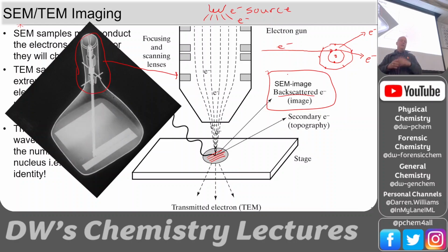And the way we get around that is we take our sample, we put it in an oven, or like a vacuum chamber, and then we have a hot gold wire above that. We pull a vacuum on it, and then we heat up that gold wire, and gold will come spewing off of that wire, and it will coat our sample. Or we can do it with carbon, like graphite, but gold is very common. So you have a little gold coating machine. You put your sample in there, you coat it with gold. A very, very small layer of gold, not enough to change the sample, not enough to destroy the sample, but enough to conduct those electrons away. And then you put it in your instrument, and you get a scanning image of it.